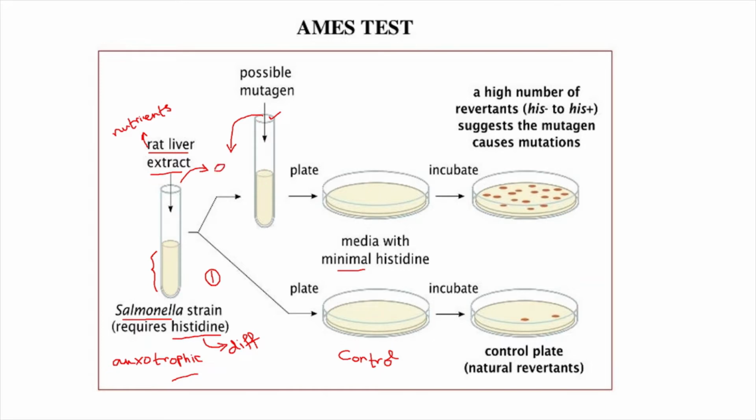We are mixing it into a third test tube, and we are plating the contents into another medium. This is the second procedure. We are plating it into another medium, and this medium also contains minimal histidine.